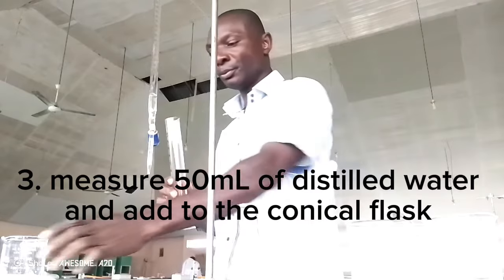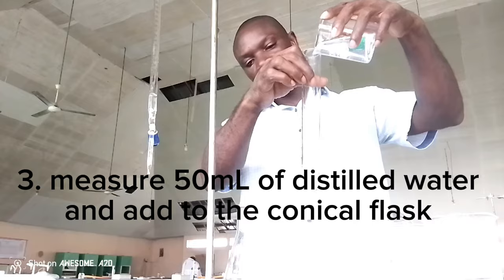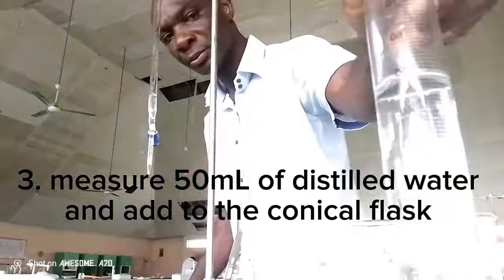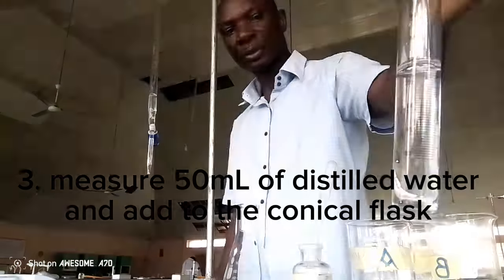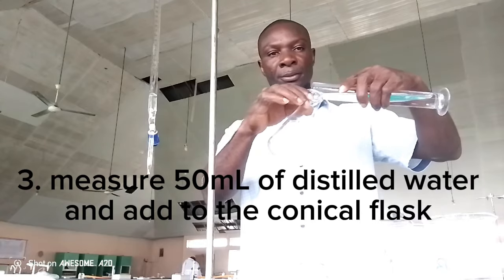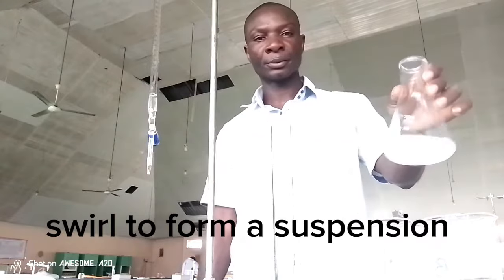Measure 50 milliliters of distilled water and add to the conical flask. Swirl to form a suspension.